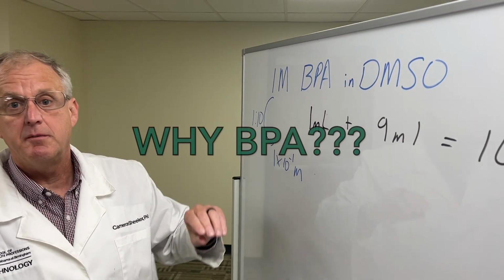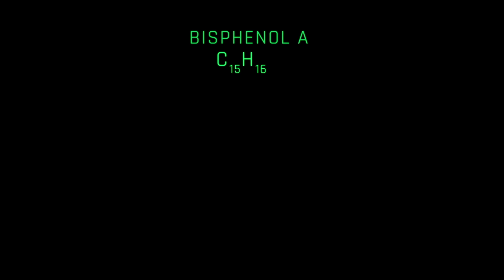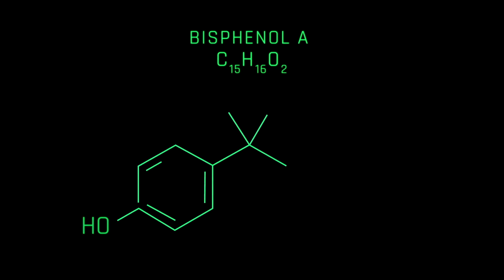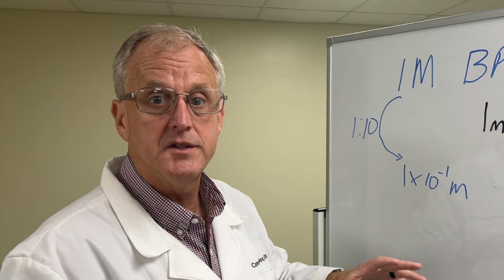It's dissolved in DMSO. Why are we going to use BPA? Because my research involves environmental toxicants and their effect on gene expression, development, and potential risk. And BPA is just one of the many chemicals that I'm studying.